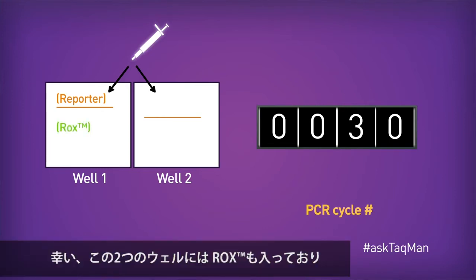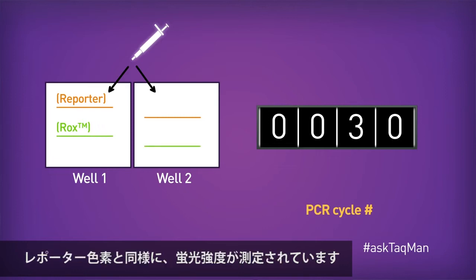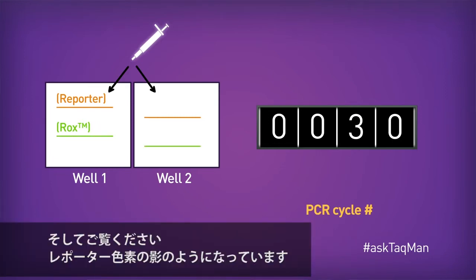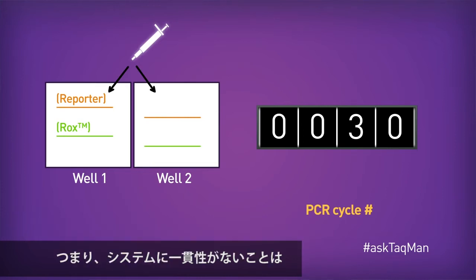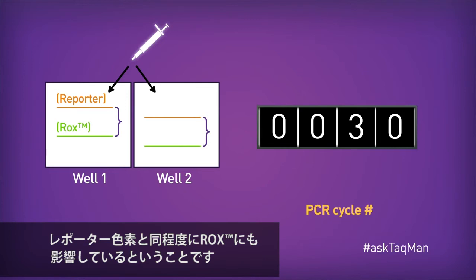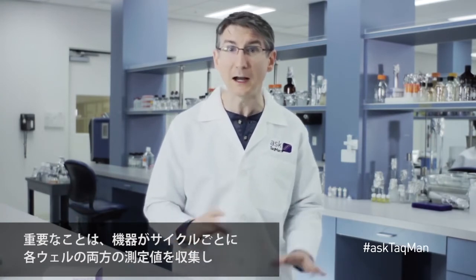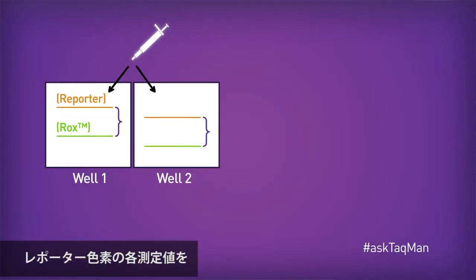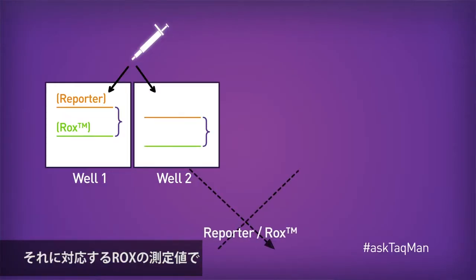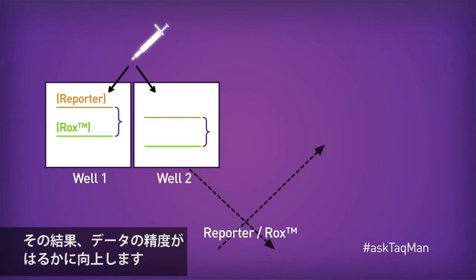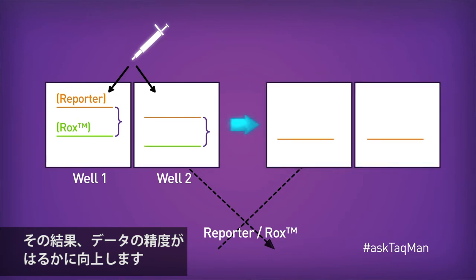Fortunately, we also have ROX in these same two wells, and like the reporter, it's also being measured. And look, it's actually shadowing the reporter. In other words, the system inconsistency is affecting ROX to the same degree that it's affecting the reporter.